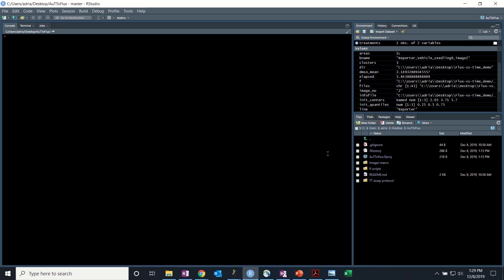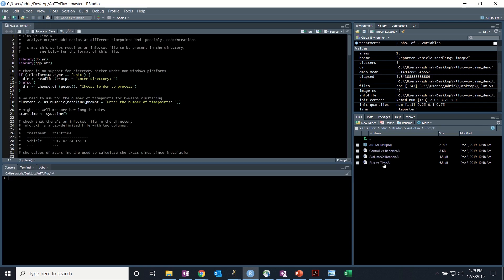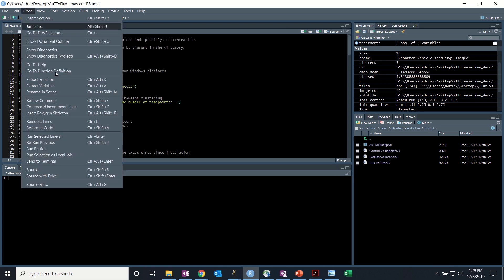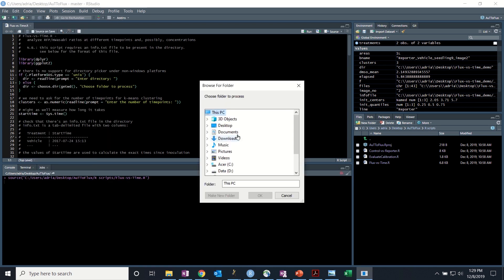So back to RStudio, select R script and pick flux versus time dot R. Then go to code, source, source, and select the file.